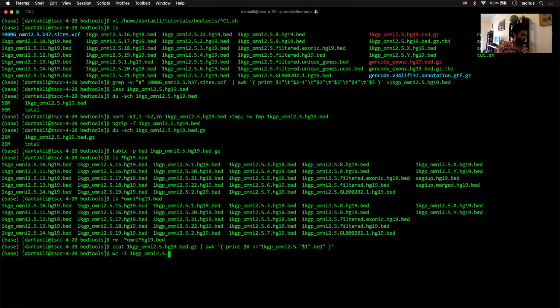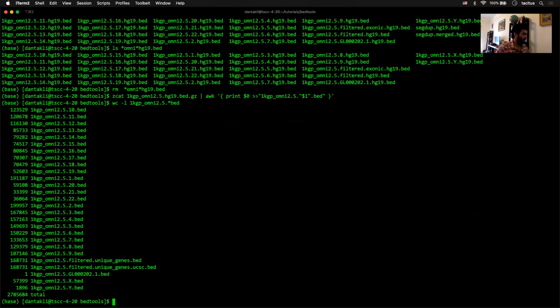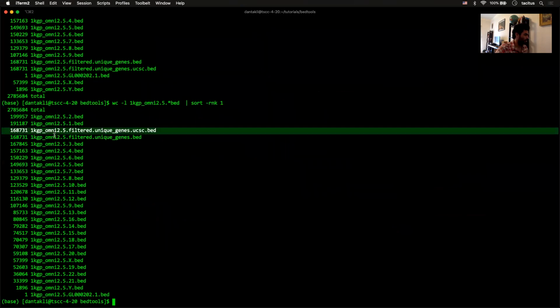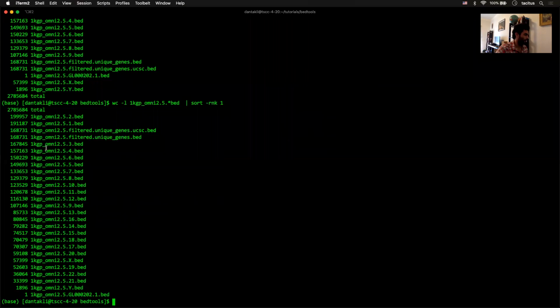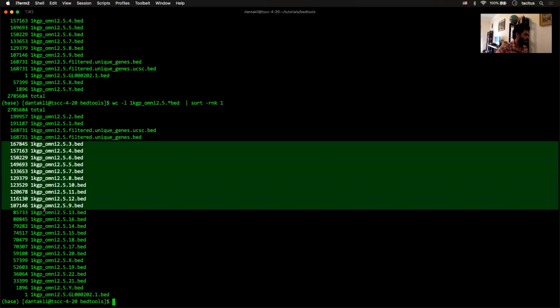And you can look at it by counting the lines, especially if you reverse sort numerically. Now you can see that chromosome 2 has the most, and then chromosome 1. Actually, I think in this reference build, chromosome 2 might be a touch longer than chromosome 1. We'll come to this later. Sorry, that's spoiling it. But you can see how it really did split it up.